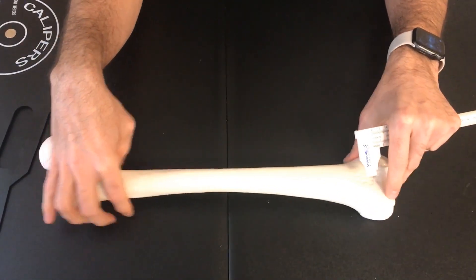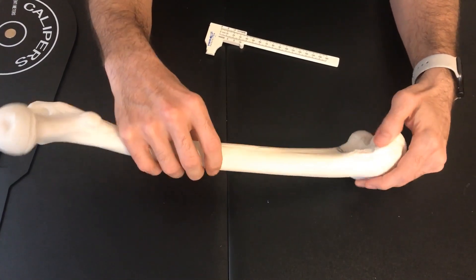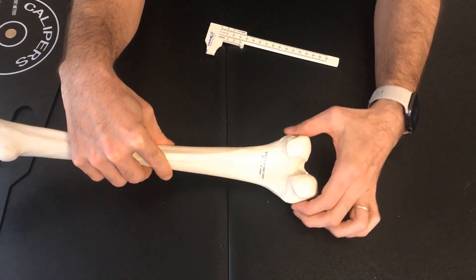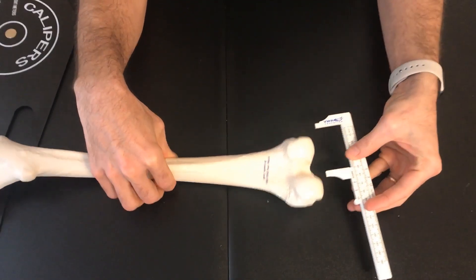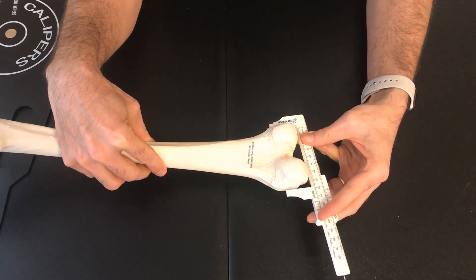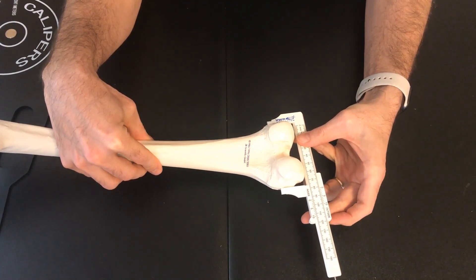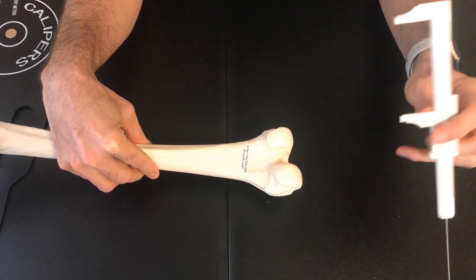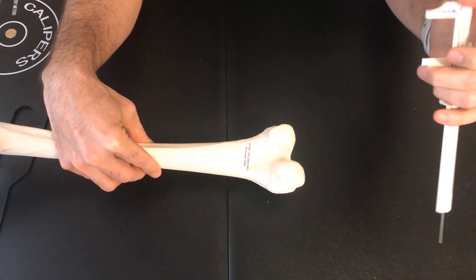The next measurement is the bicondylar width. We locate the condyles and measure the epicondylar width — the largest possible distance at that part. Using the vernier calipers, we put them around the largest possible distance, push them tight, take a reading, and we see that we have around 81 millimeters for the bicondylar width. Males are typically above 76 millimeters, so this result is consistent with a male.